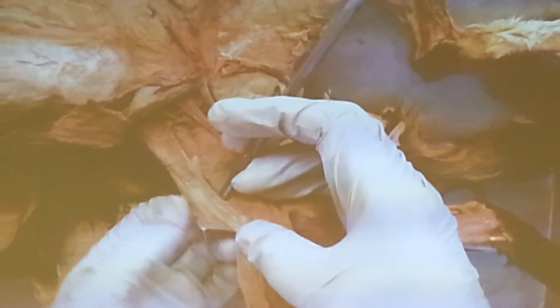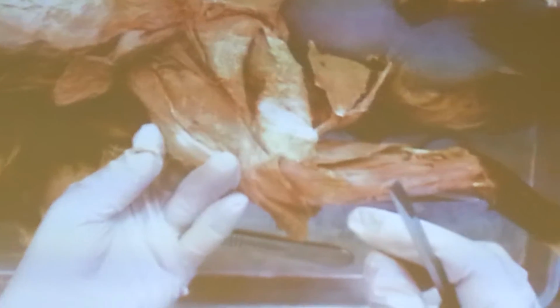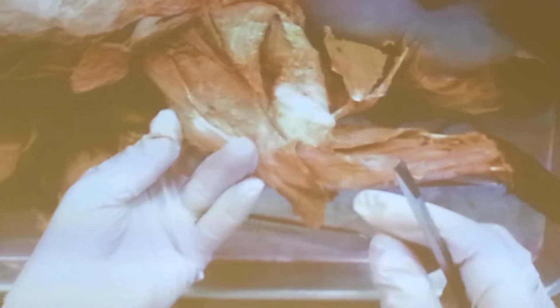The first thing below this sartorius, when you go under that, you can see this white sheet. This is a fascia, called fascia lata, or iliotibial band, another name for the fascia lata.